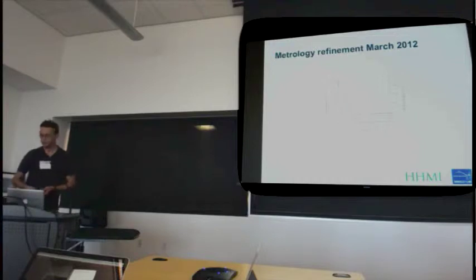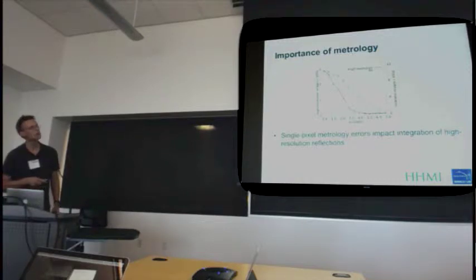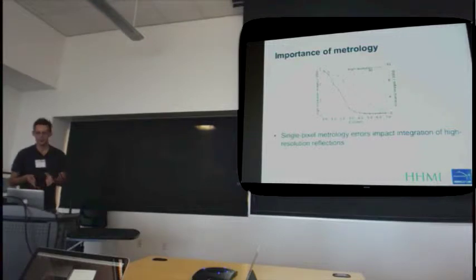That was all fine, and I think we didn't until much later realize the importance that all this would have on the processed data. And so this is from the publication that came out earlier this year. Nick talked about this, but maybe just reiterate that if we're as much as one pixel off in how we're placing these things, we tend to lose, or in this particular case, we lost a third of the high resolution images. The degradation in considering just all images is a bit slower, and what this does suggest, or maybe confirm, is that the way we have been working with metrology, starting from looking at just the quadrants close to the beam center and working ourselves towards the outer high resolution sensors, makes sense, because the high resolution parts of the detector are more sensitive to disturbances in the metrology.